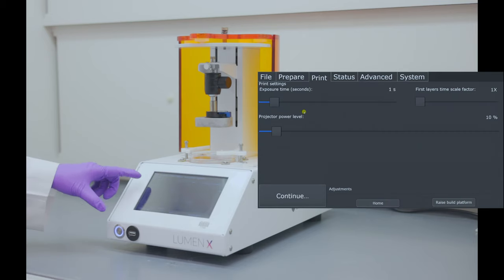Here, we will adjust the exposure time, power level, and the first layer time scale factor. Today, we will be printing with Cellink PEGDA Start material. The print settings for this material can be found online.